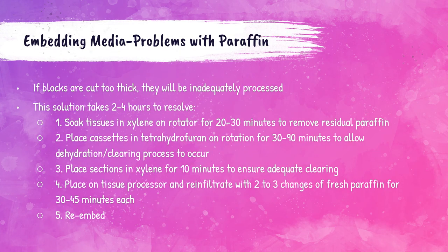If paraffin blocks are cut too thick they will be inadequately processed. To resolve this, which takes around two to four hours, the tissue must first be soaked in xylene on a rotator for 20 to 30 minutes to remove residual paraffin. The cassettes are then placed in tetrahydrofuran, a universal solvent, on the rotator for 30 to 90 minutes to dehydrate and clear the tissue — at the end of this step the tissue should be transparent. The sections are then placed in xylene for 10 minutes to ensure proper clearing, then put on the tissue processor and infiltrated with two to three fresh changes of paraffin for 30 to 45 minutes each, after which the tissue can be re-embedded.